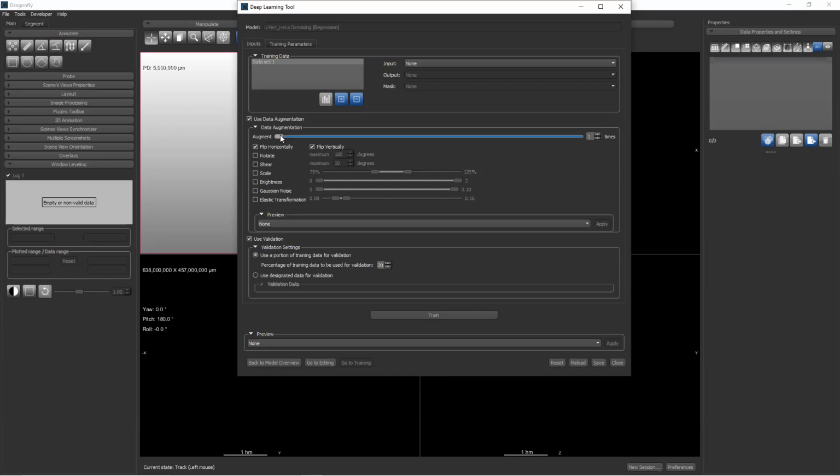So if you only have 1 megapixel of data, but you drag this bar to 5, now you can have 5 megapixels of training data. The success of your network, how fast it learns, how far it will go before it converges, does depend in part on the training data. With this, you're giving yourself more training data. You're cheating to get more training data than you actually paid for.